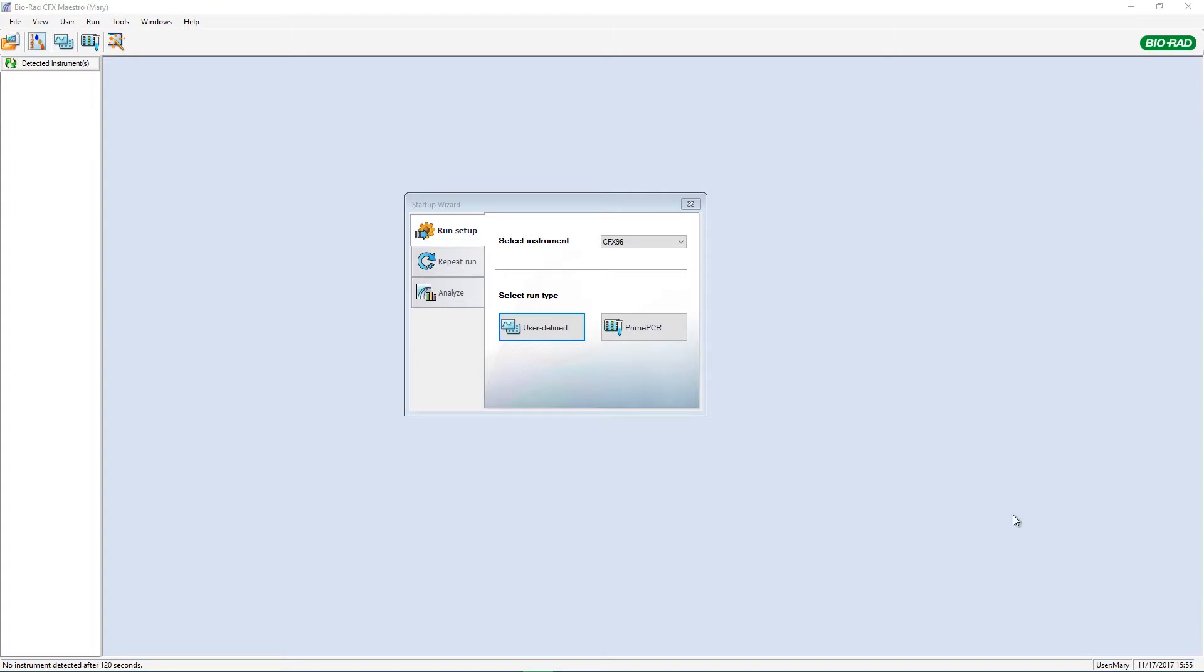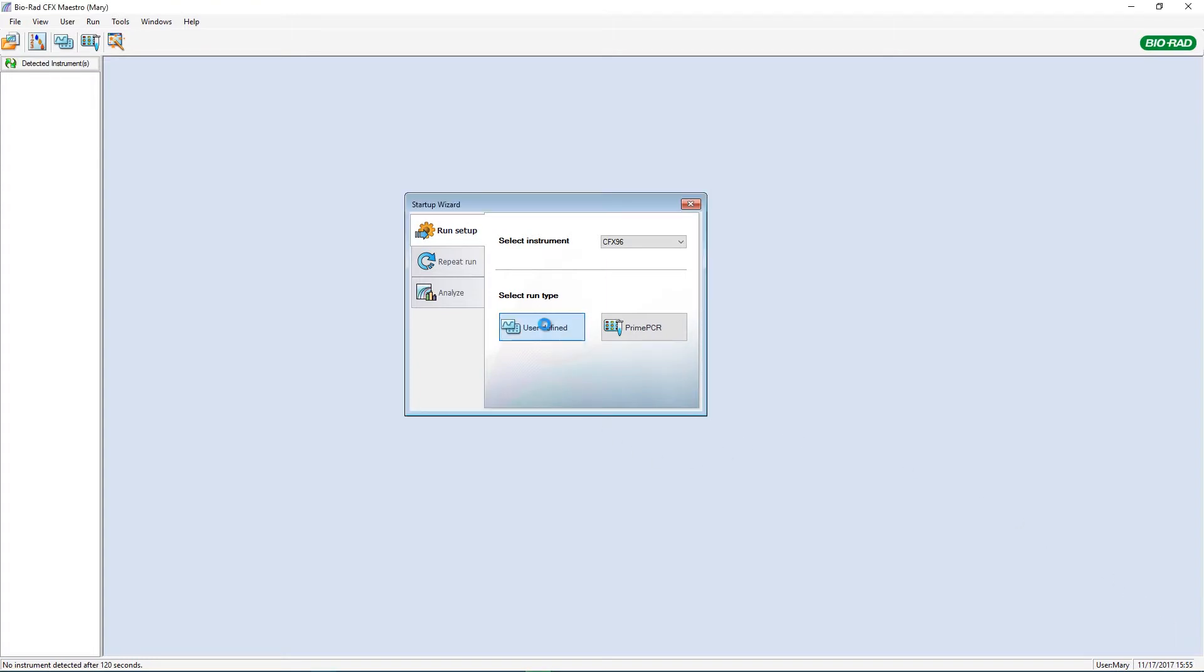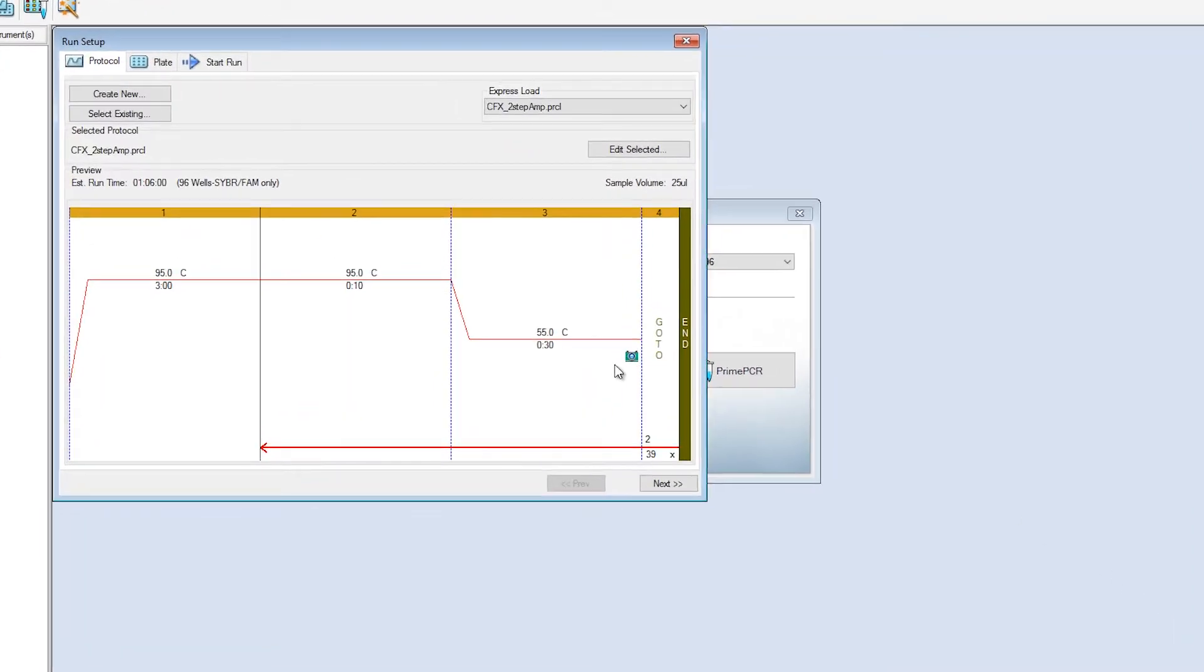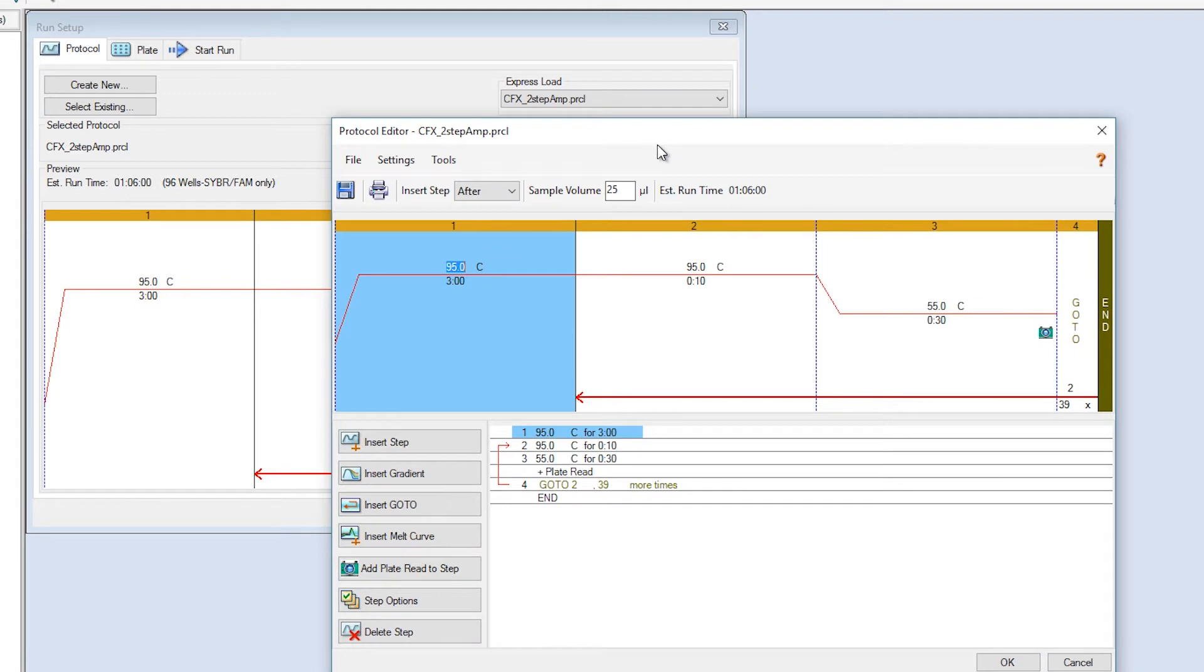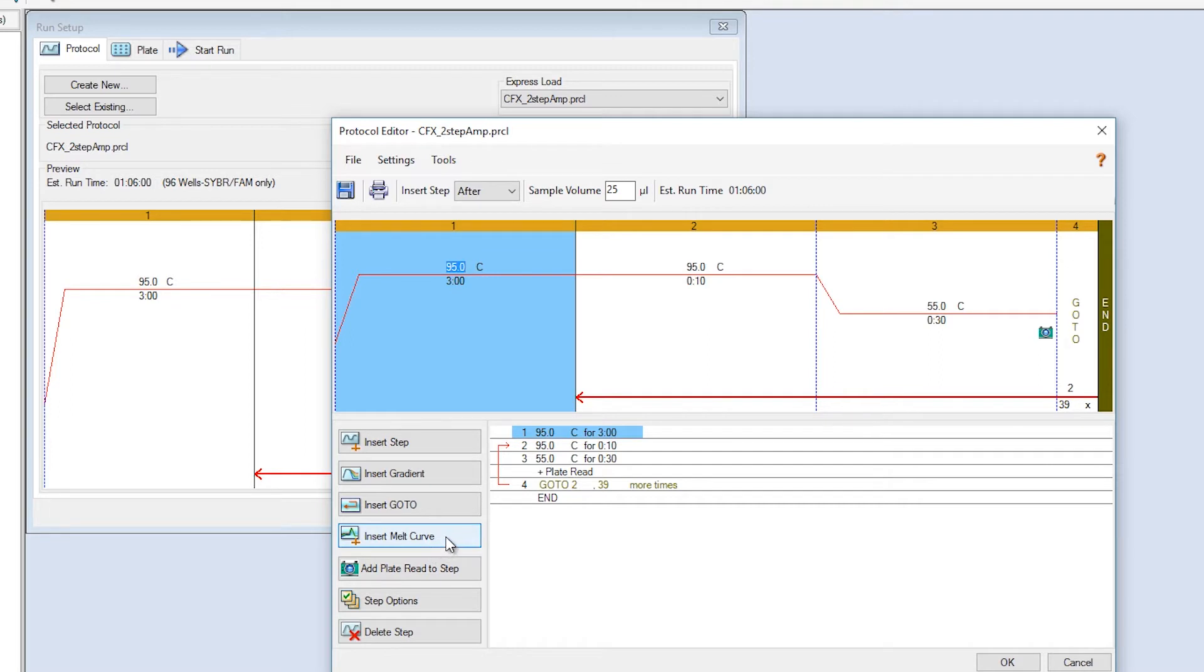I'll start by selecting a new run in the startup wizard. You can set the run conditions including temperature and time at each temperature. Also, when running SYBR Green as your fluorophore, you can program a melt curve step.